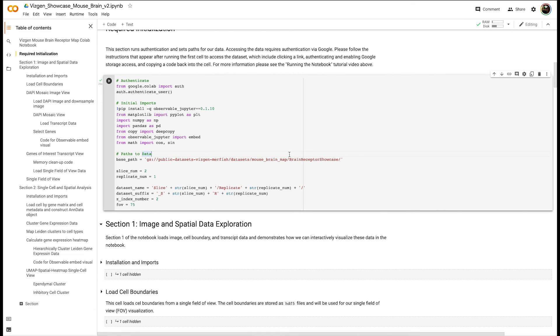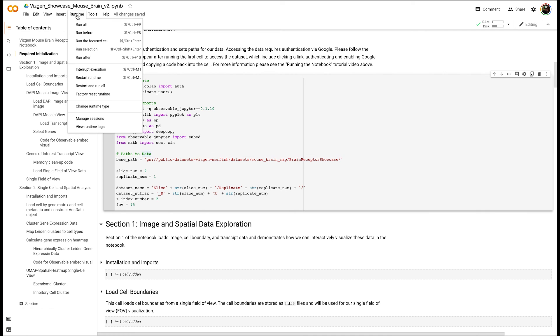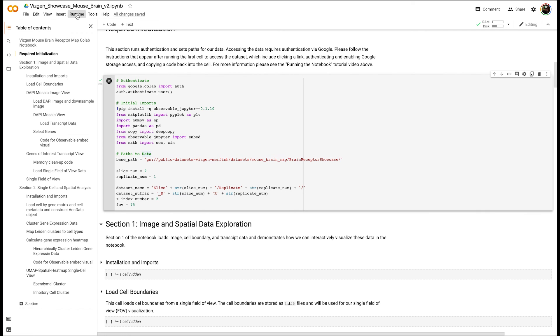One way to do that is by clicking Runtime and Run All, and it will execute the entire notebook. Because of the large data we're downloading, it could take about 40 or so minutes to run the whole notebook, although you can run the two different sections separately if you're interested.